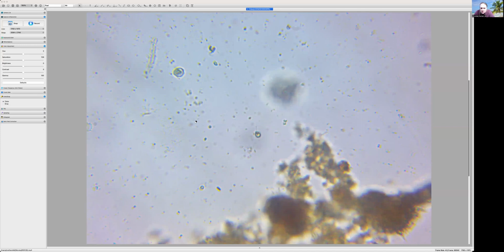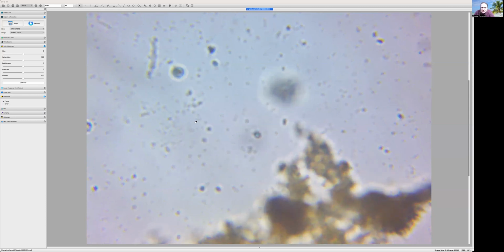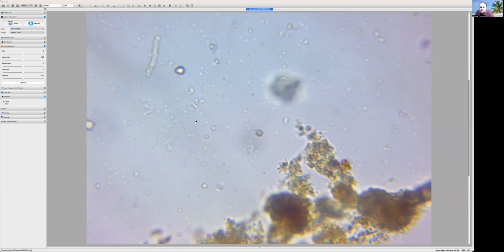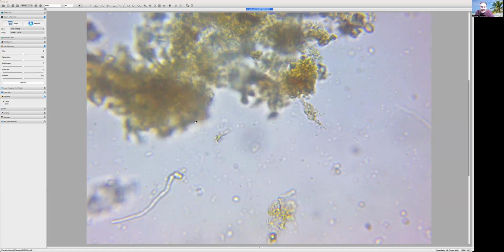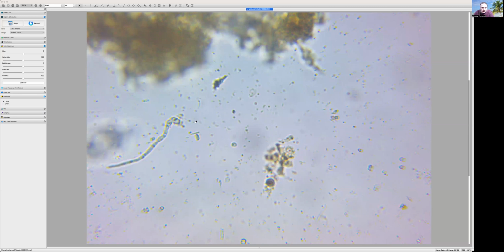I wished I could see way more lactobacilla, but this bin didn't seem to have as much as my last tea. I brewed a sample from black soldier fly. Was it loaded with lactobacilla? Okay, so there's some more flagellates. That's what my goal with this tea was, to see if I could manipulate that protozoan numbers, and definitely we did.